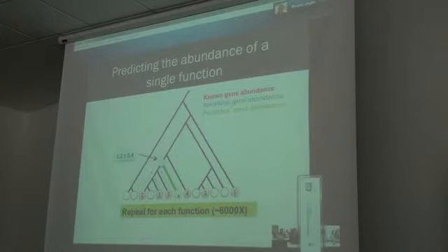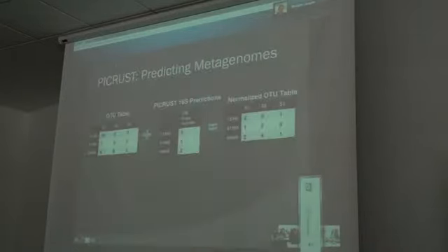So then if we're looking at, say, KEGG orthologs, where we're using a set of about 8,000 different genes, we actually have to repeat this for every single gene in the KEGG ortholog. And to speed things up when we use PICRUSt, we pre-calculate what every single one of these tips looks like beforehand and provide the user with a database of pre-calculated tips in the tree. For Greengenes, that's approximately 100,000. So that's how that's done.